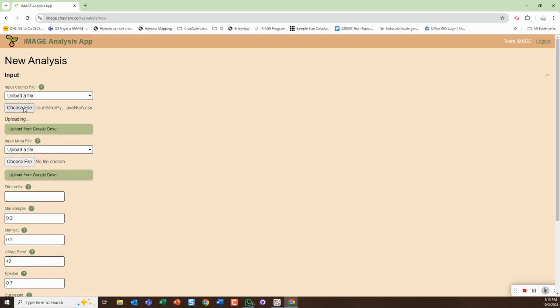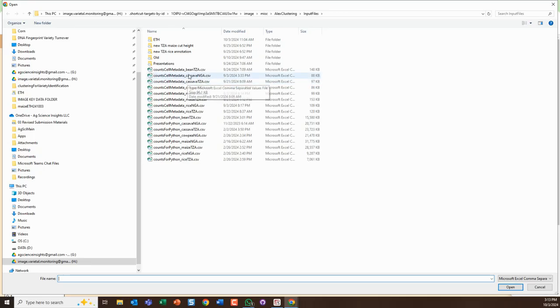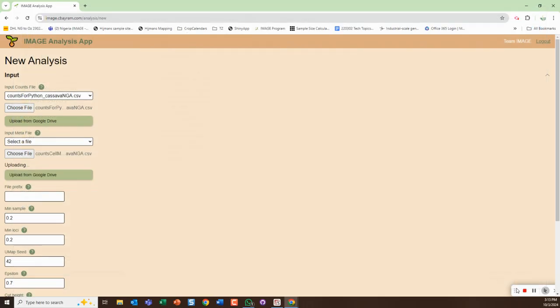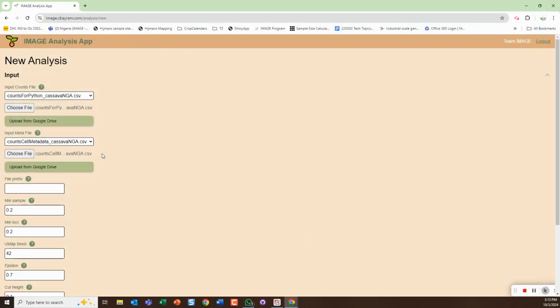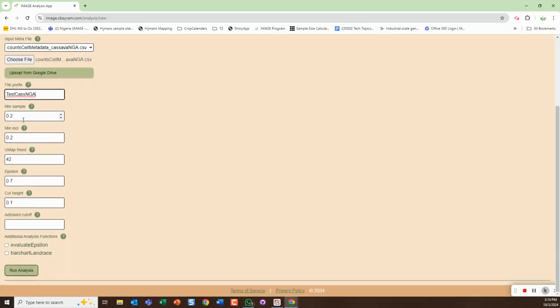I'm going to open that and then it's going to be loading it. I'm going to choose the corresponding metadata file, so that was the counts and this is the metadata file. Open that and you can see once it's loaded them it gives them there. Then the file prefix I'm just going to call it test CAS NGA.